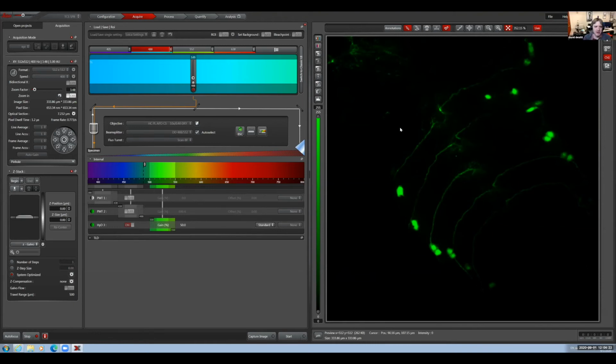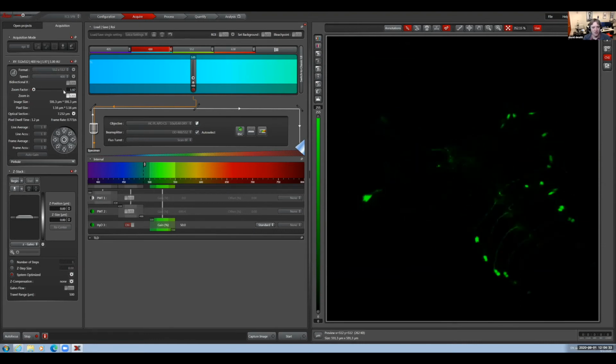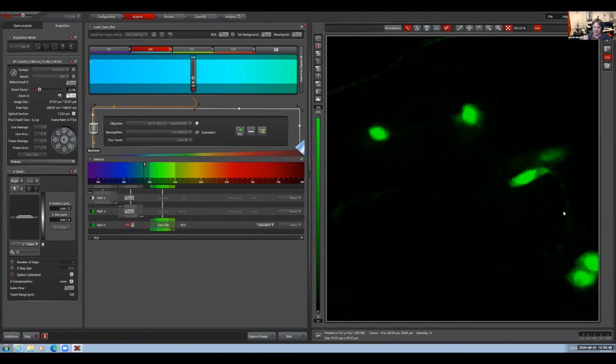And so right next to that zoom in where you just did that, now there is an undo arrow where if you want to zoom back out, that will take you back to the previous zoom level. So the zoom in just gives you a one-time chance to do it and then goes back to off. And if you click it on again, you can zoom in further. So you can actually zoom in multiple times and just get smaller and smaller each time.